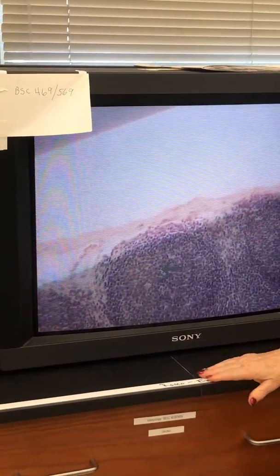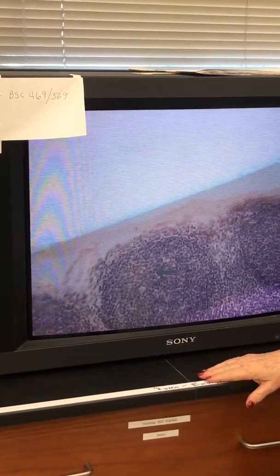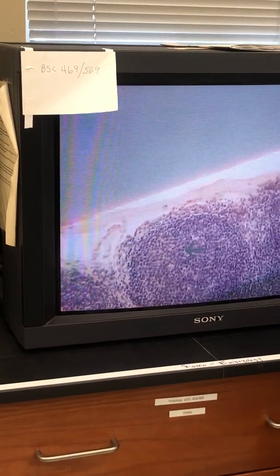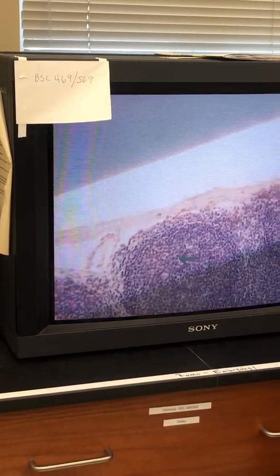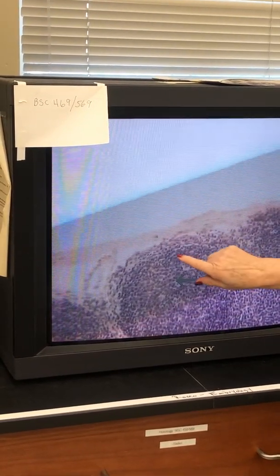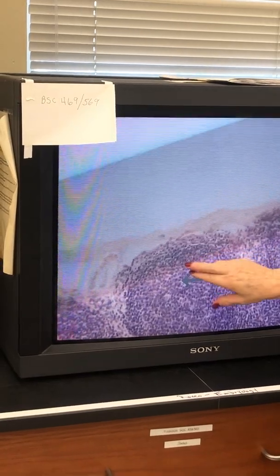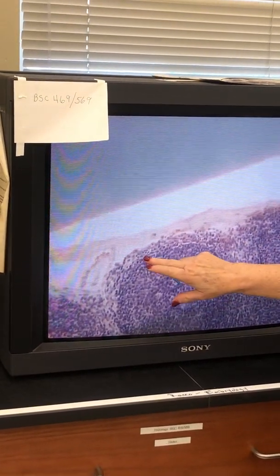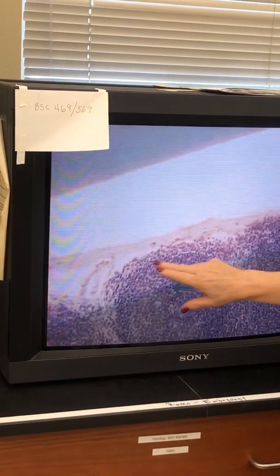I'm thinking I'm on the right place where you would find your littoral cells, because a sinus is a big capillary, and capillaries are lined by endothelial cells. You remember how they stretch out, and bunch up a little bit and stretch out, attached to each other. So if this is a subcapsular sinus, we would expect to see endothelial cells somewhere in here.